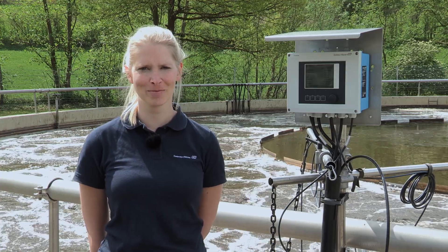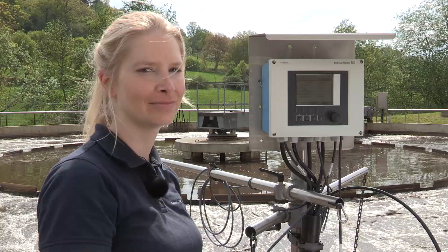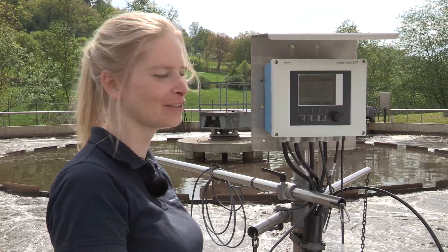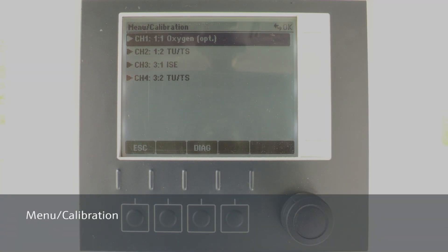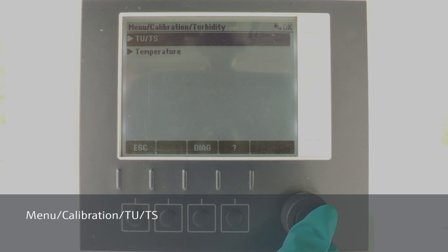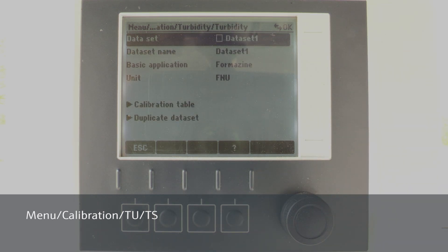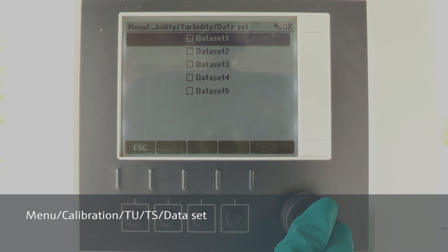Now we are ready for the calibration itself and can continue with the LiquiLine CM44. Push the calibration button at the CM44. Select your sensor channel and confirm the subsequent options until you get to the calibration menu of the sensor. Now we create a dataset which will store our calibration data. We enter dataset to select an empty dataset, which are indicated by an empty square.